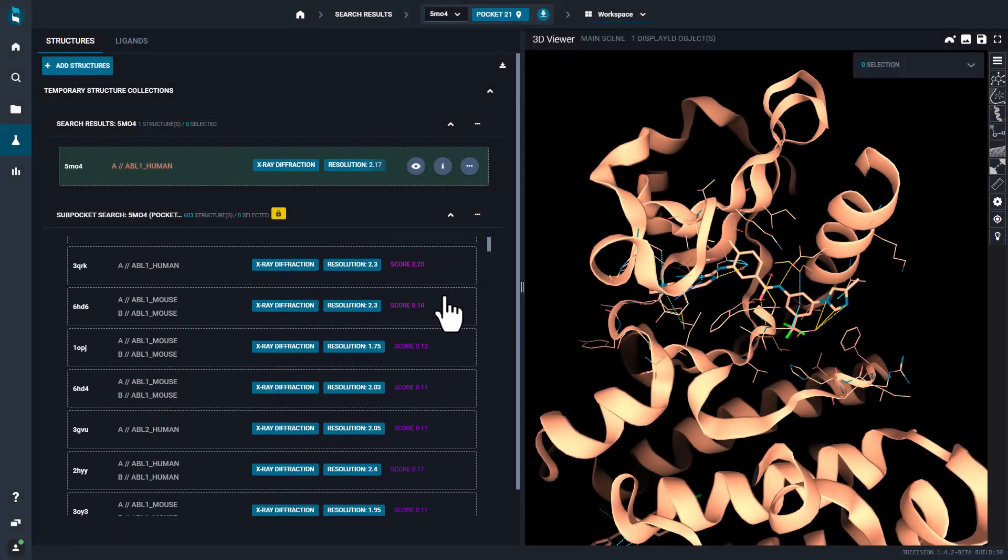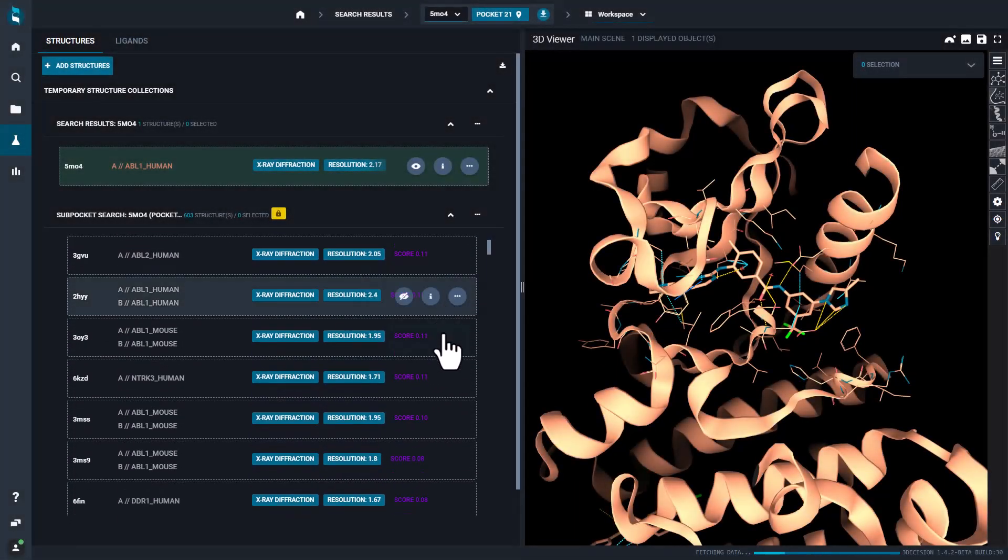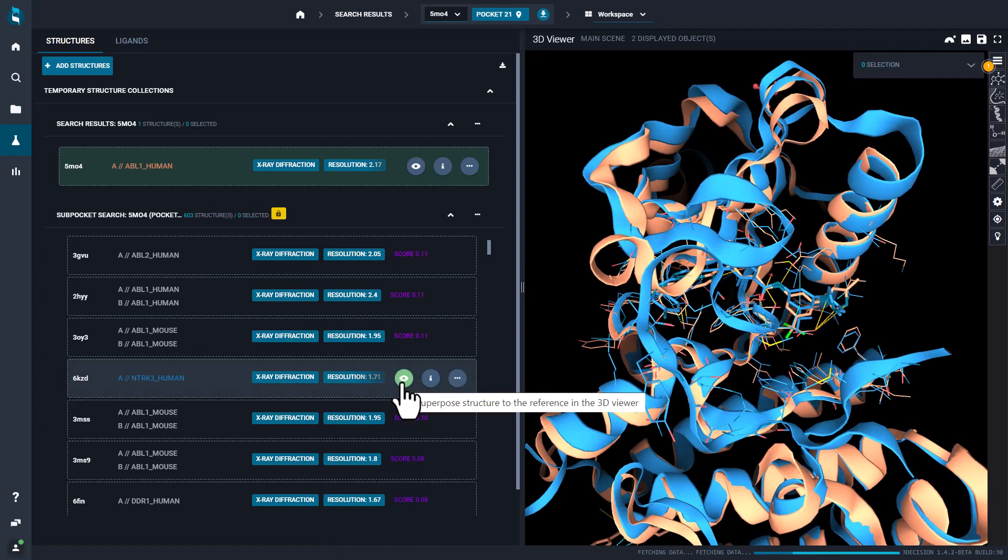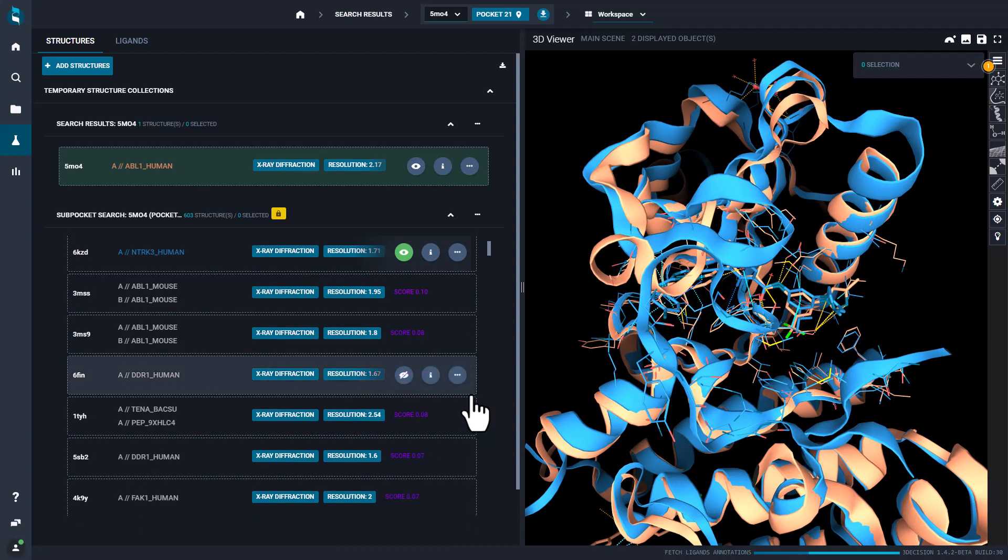You can analyze the results of your search and superpose structures on the fly, to detect differences among the pockets directly into the 3Decision viewer.